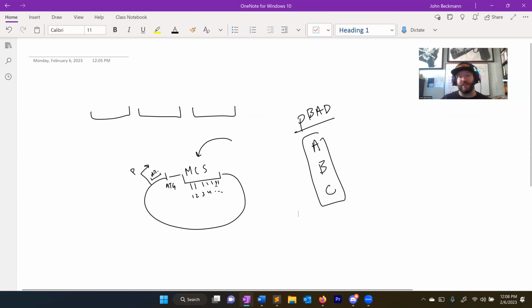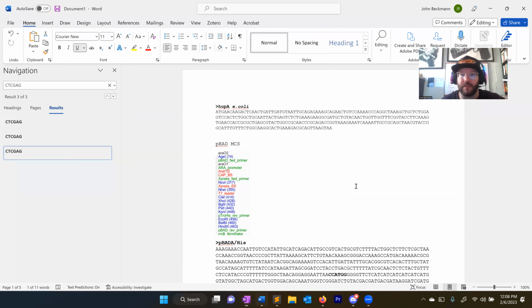The reason I didn't want to show how specifically to do this is because it's a context-specific example. What I'm going to show you today, the concept will be the same, but you're going to have to figure it out for yourself. I'll show you how to do it, but it'll be different every time you make a clone. So let me show you how to properly clone in frame now that you understand what that is.